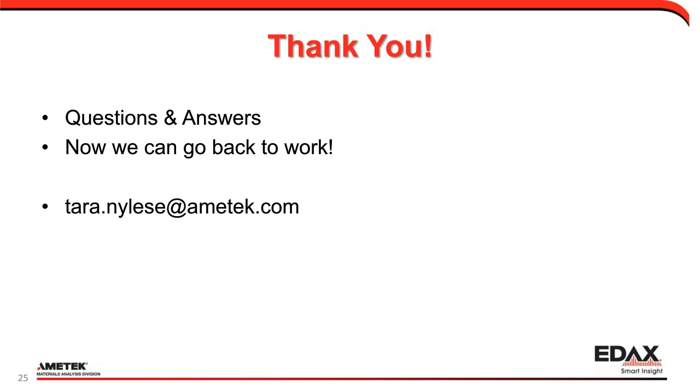And the first question is a very interesting one. We've got a TEAM user. Nice to see. Thank you for using the EDAX TEAM software. And if you're a beginner with SEM EDS, as you mentioned, the APEX software might be something that you'd like to explore. So certainly reach out to us.